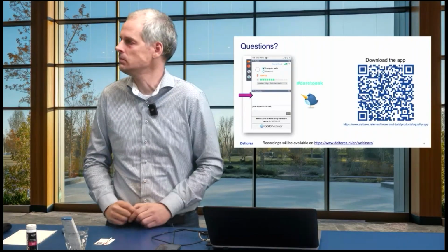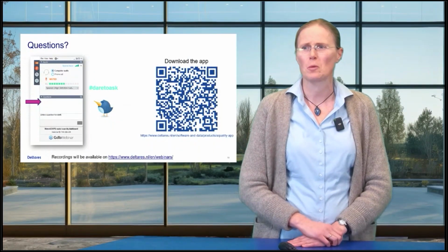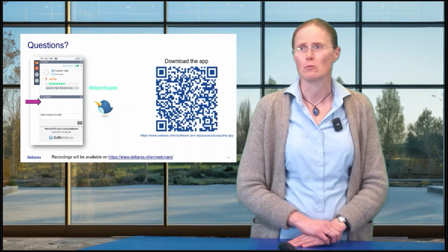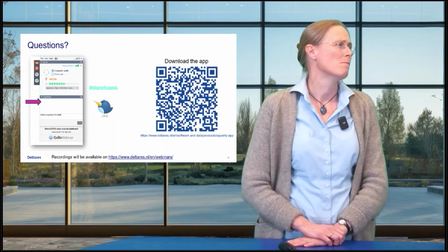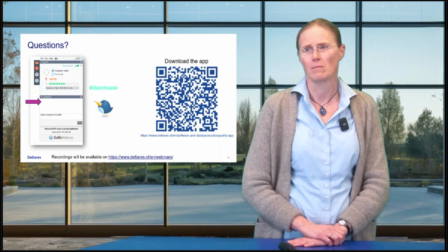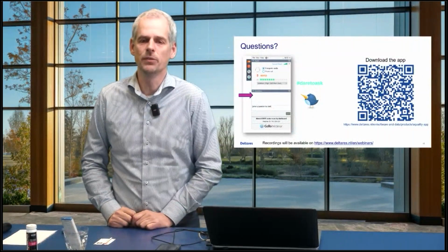Hey, and there's a few questions that are a bit related to how the data is stored, and if it is possible to extract the data from the phone to do further analysis on it, for example, on your computer. Yeah, that cannot be done directly from the smartphone, but we have a web platform for that.